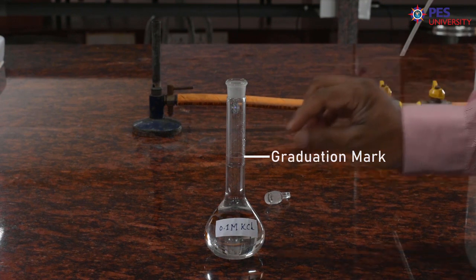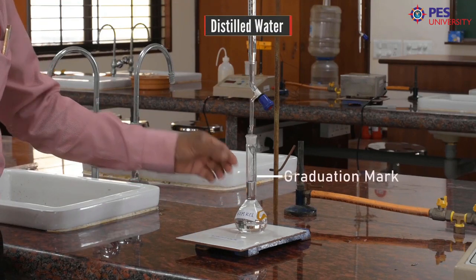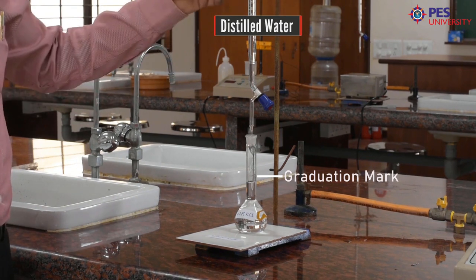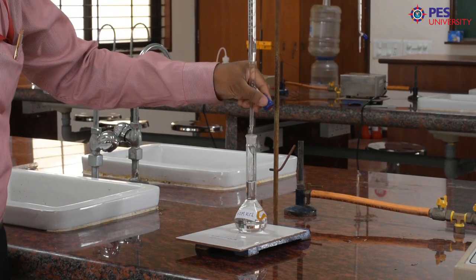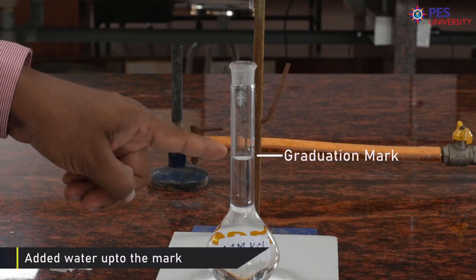Then for the final makeup, you have to fill the burette with distilled water, then make up to the mark using distilled water. We have filled water just below the mark. Now let us make up to the mark. First we fill this burette with distilled water, then add slowly drop by drop. Now you can see that we have added water up to the mark.